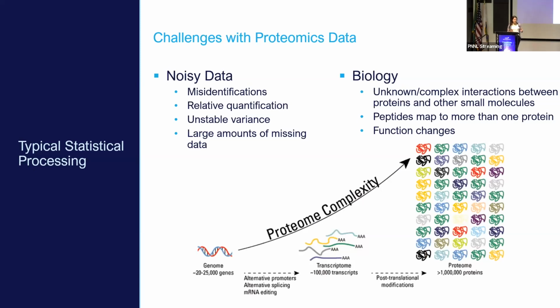So for proteomics data, we have a little bit of a challenge. And I'll say also that most of what I'm talking about right now in this talk is also applicable for metabolomics and lipidomics data from mass spectrometry. There are some extra steps for proteomics and some steps that are specific to proteomics, so I'll call those out. But in general, it's a very similar workflow for any of those mass spectrometry data.